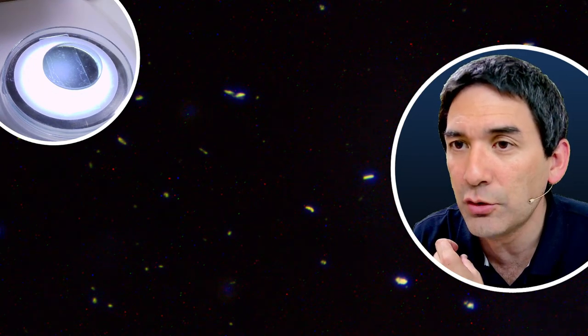Okay, let's see how this actually works. In the meantime, citric acid dissolves very well in IPA, just in case you want to try. Citric acid I've tried before, and I've done the following. I melted the citric acid over heat, and then it also starts to crystallize, but it takes a day or 2 days for the crystals to grow. So citric acid also makes very nice crystals.